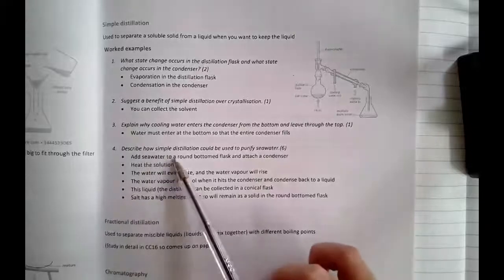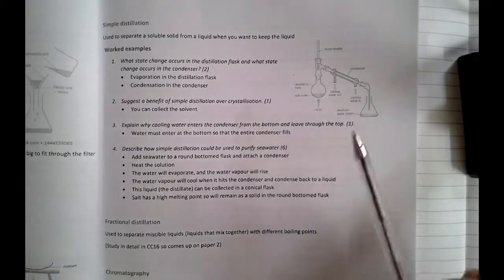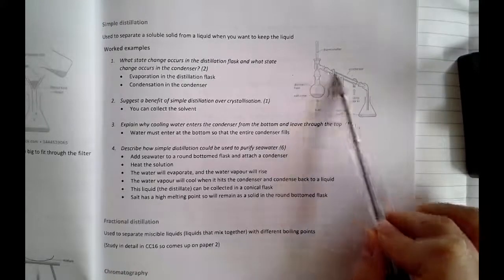And then, how could you use simple distillation to purify seawater? If you wanted to purify seawater, you need to remove the salt from the water so that you can drink it. If you want to be left with drinking water, then you don't want that water to all escape, which is why distillation would be perfect. So you put your seawater in your round bottom flask, and you attach the condenser. Remember, you don't want that water vapor to escape.